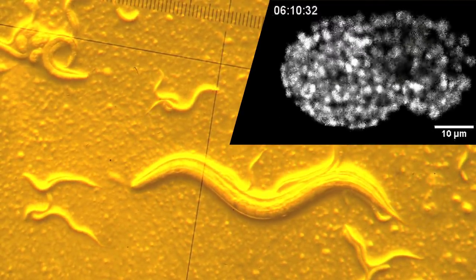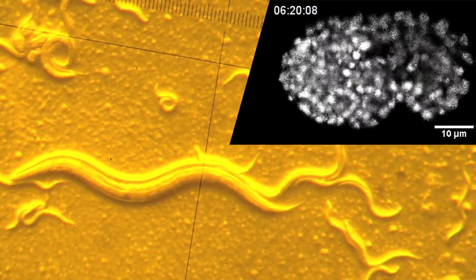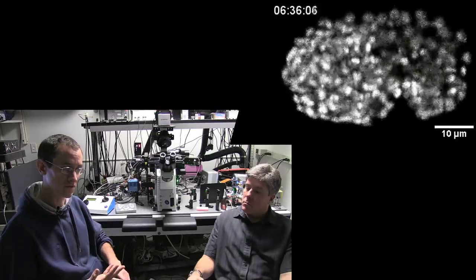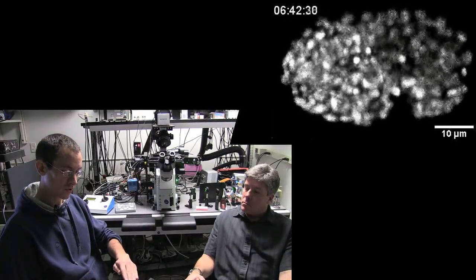What we've done here is we've extended, we've preserved all the good qualities of that microscope. It's about as fast, it has about the same resolution, you see just about as well, but you can look much deeper.